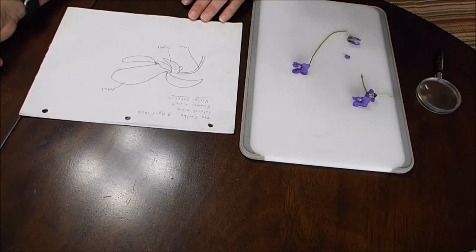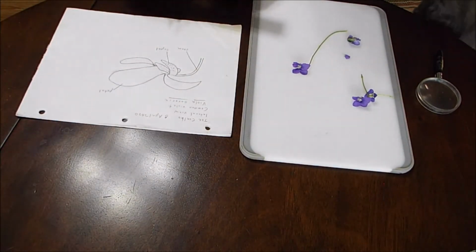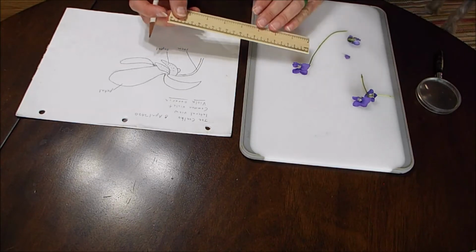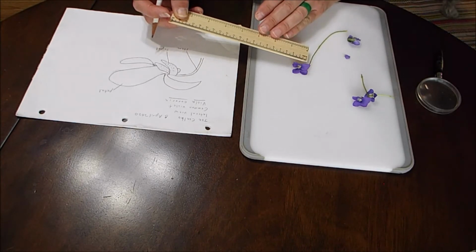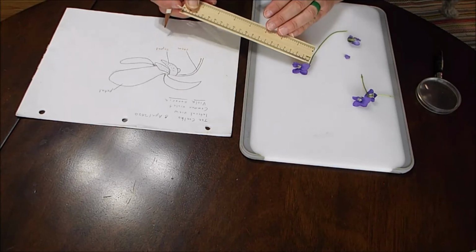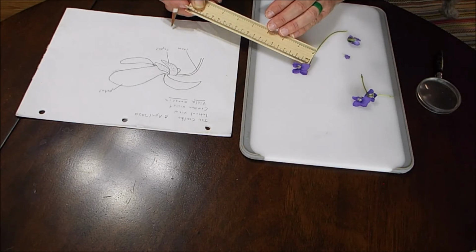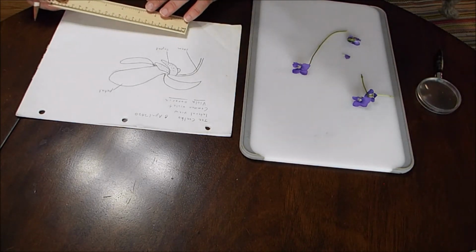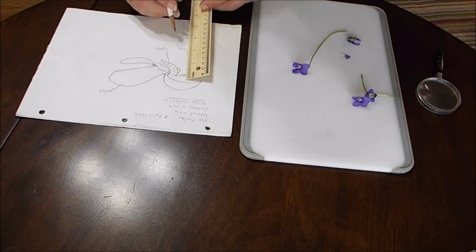And the last thing I need to do is to establish a scale, right? So we know how big it is. So if I measure the whole flower, it's 2.2 centimeters. Let's go. Gotta find something convenient. Okay, so if I go from the end of the sepals to the lower lip, that's 2 centimeters. So that's basically here to here.